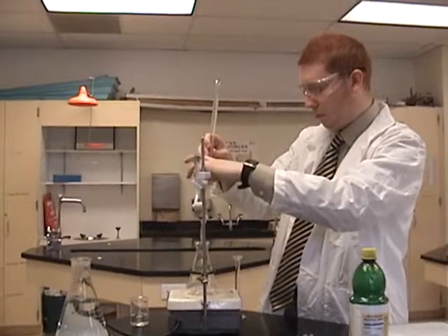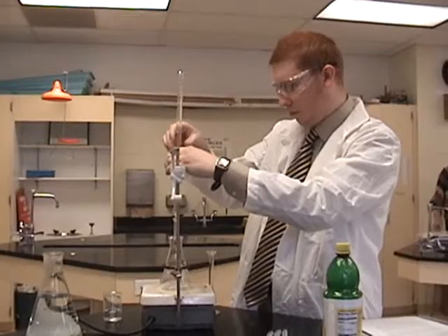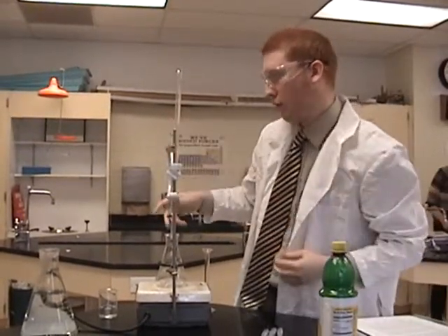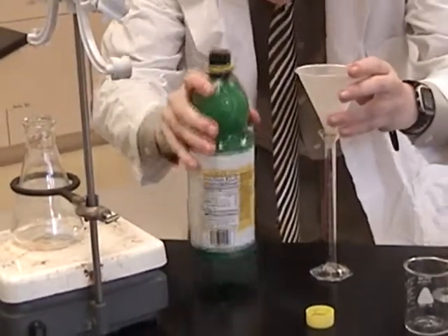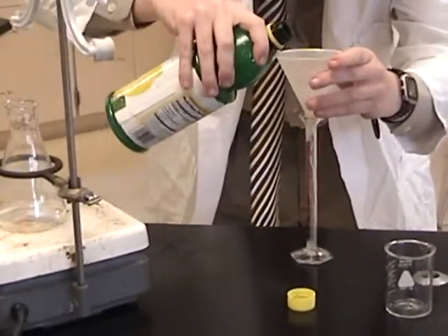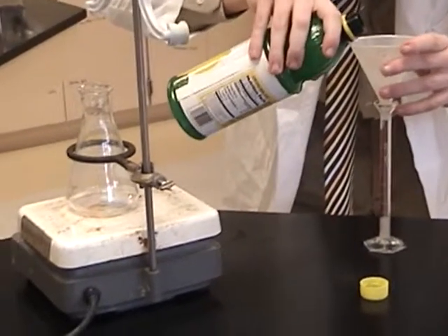In this case, we are titrating lemon juice to measure the concentration of citric acid. For this experiment, measure out exactly four milliliters of the lemon juice in a graduated cylinder. Then add about 40 milliliters of distilled water into the beaker along with three or four drops of the phenolphthalein indicator.